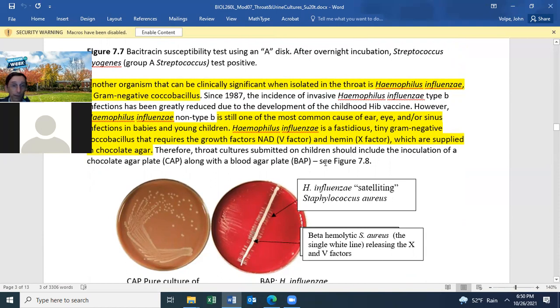It does not grow on blood agar, so you need to grow it on chocolate agar. Chocolate agar is the same as blood agar. It's just that you add the blood when the agar is still very hot, and that lyses the blood. Haemophilus influenzae does not lyse the blood to get the nutrients it needs from red blood cells. But if you provide it with chocolate agar, you can get growth of Haemophilus influenzae on the plate.